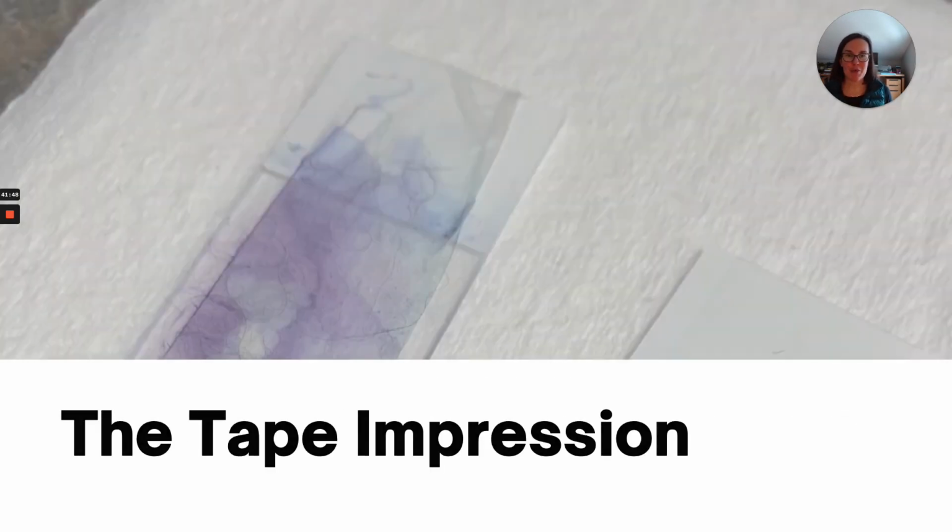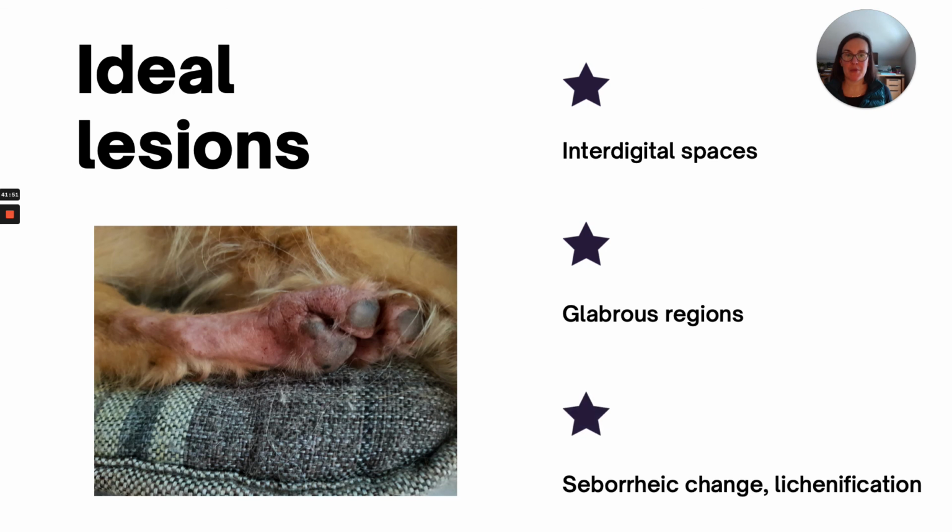So I love tape impressions. I think they're very useful. The regions that I like to sample with tapes are interdigital spaces, glabrous regions, which are going to be your inguinal area and your axilla, and then anything that has a lot of seborrheic change or lichenification. Seborrheic change is basically like getting an ear swab of the skin, right? Because you're going to have all this seborrhea, all this kind of waxy debris coming from the skin. And so sometimes the tape can really help neutralize that, and it makes it a little easier to look at those slides than having to worry about them washing off with the fixative.